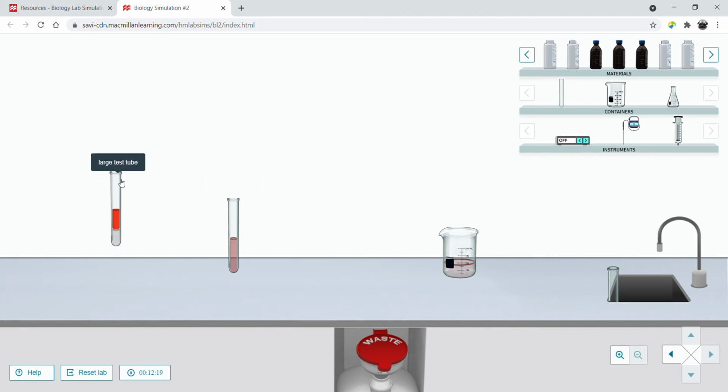Aha! I'm going to lift this up so you see. Remember I said the red dye of the Sudan 4 bonds to lipids and it floats on the top. Do you see that? And this is water. It's just that pinkish color. There aren't any lipids in water to bind with that. All right. That's your lipids test. Make sure you have that all recorded in table 3.